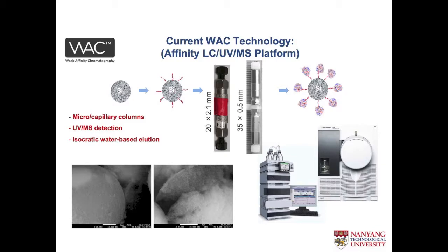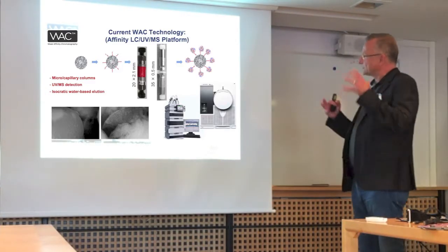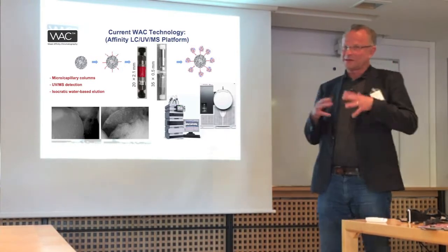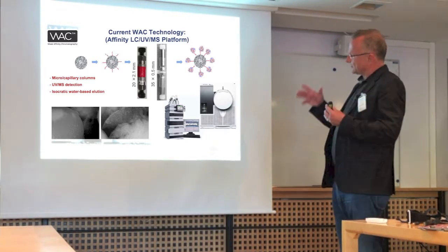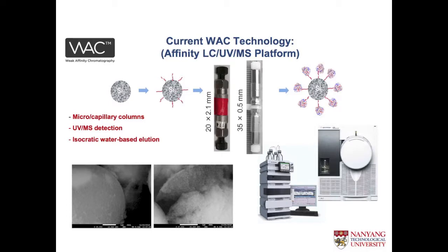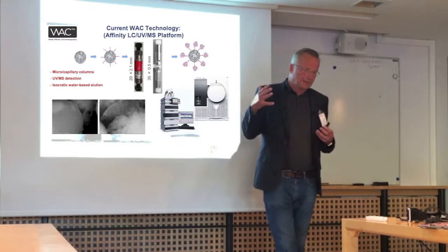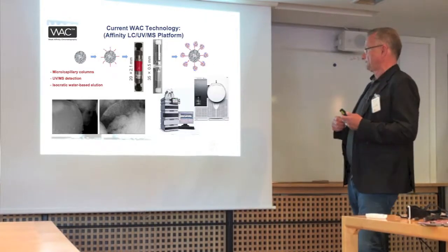You can work with other detectors too, like UV, but the standard setup is an MS machine hooked up to a standard LC-MS platform. And here are a couple of electron microscope images I took just a year ago. We have a very powerful microscope in Singapore, and I was thinking, can I see those proteins? Where are they sitting, and things like that. But we were not able to do that within my time. But we got some nice pictures of just the silica particle at around 20,000 times. You can see all these pores, which is very important, because you need a porous particle so you can immobilize a lot of material onto it.